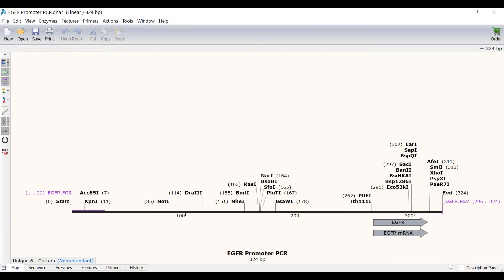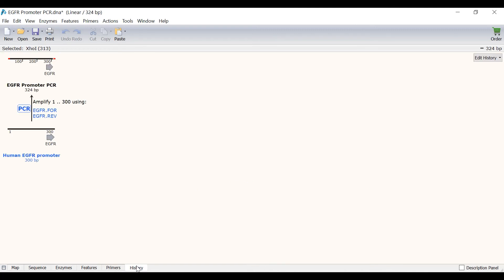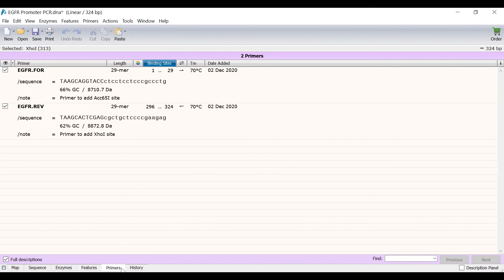In this new file you can see that the ACC651 and XHO1 sites have been added to my sequence. Switching to the history view will provide a schematic flow chart of the steps I have just performed. If I go to the primers view I can see the list of primers used in this file. You can also see additional primer information including the sequence, binding region, directionality, and melting temperature.